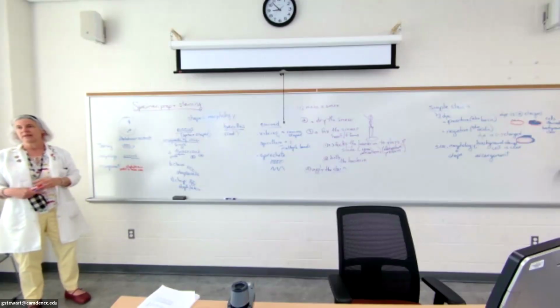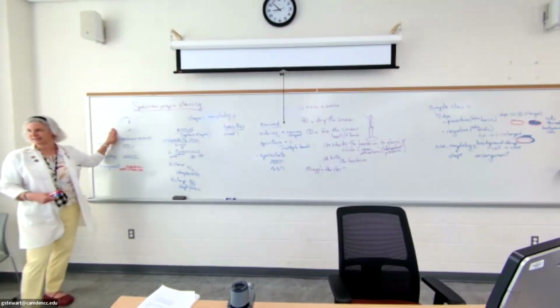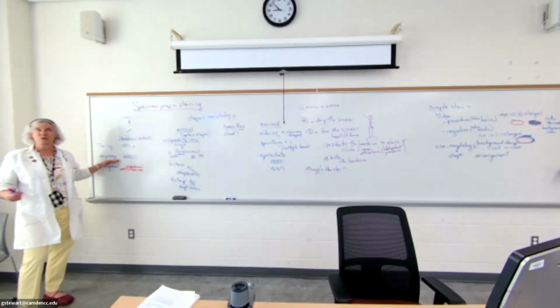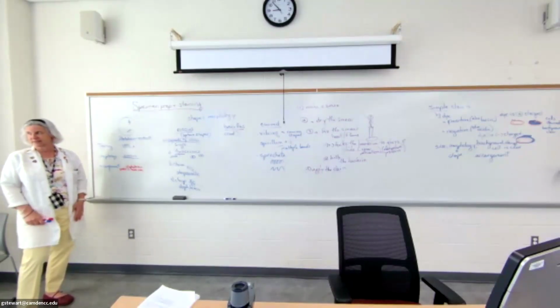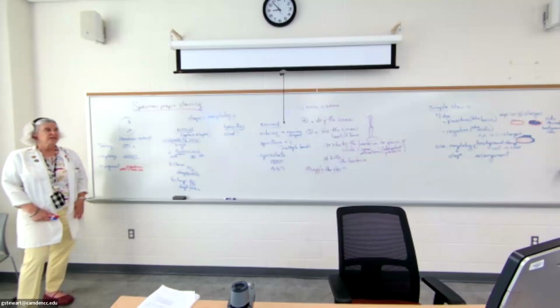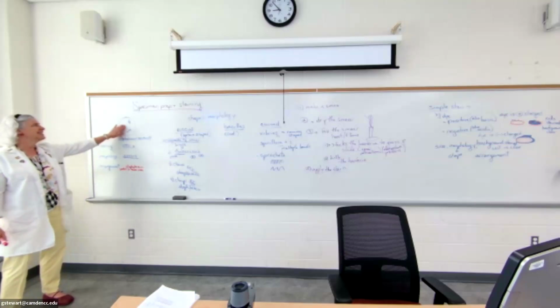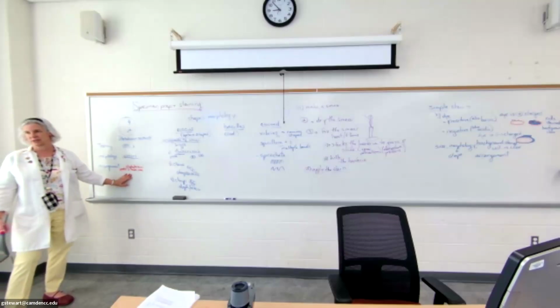Right? Your lab book is always going to tell you what you're looking at, right? And sometimes it's a big clue to either its morphology or its morphology and arrangement. You just have to spell it correctly and make it the first letter lowercase. It's an important difference because this isn't the only bacteria that has this morphology.